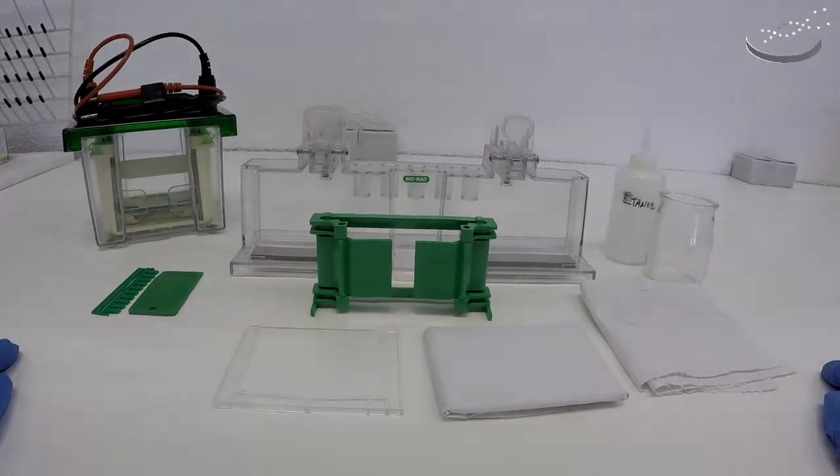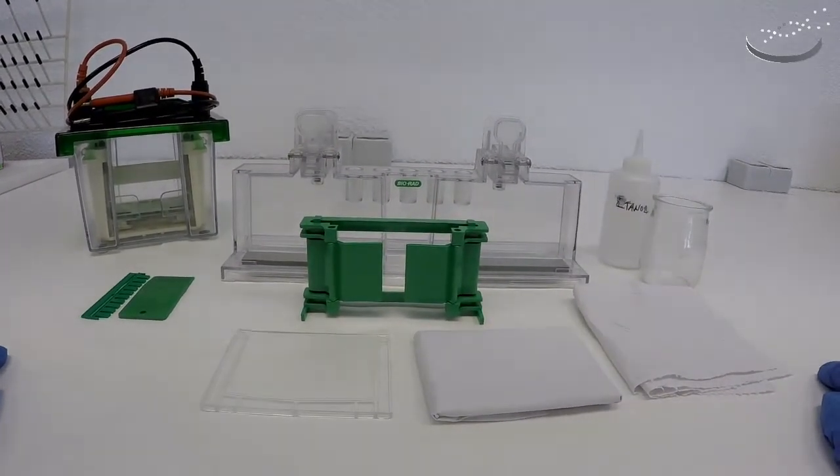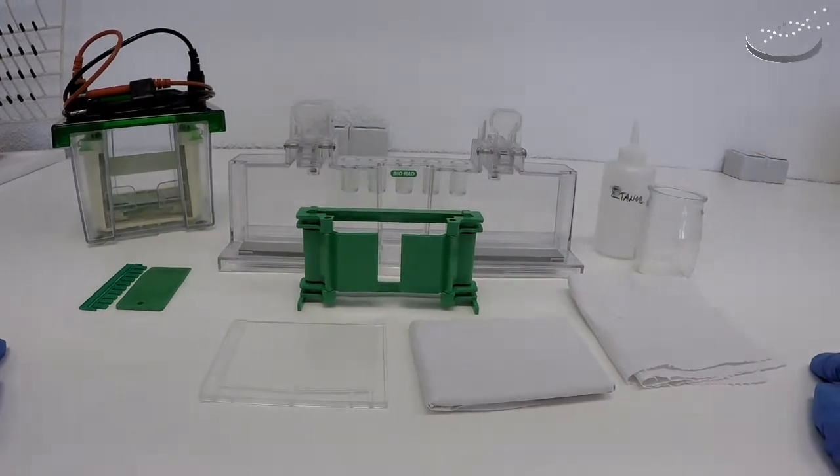In this video we're going to see how to set up a protein gel electrophoresis system. This is the BioRad system. We're going to show you how to set it up today.